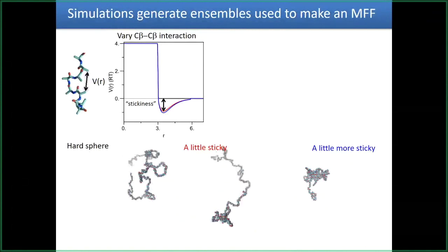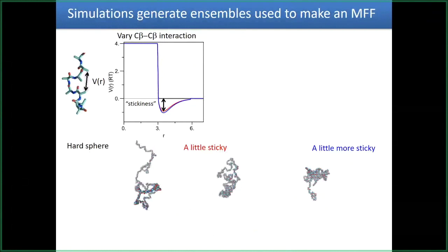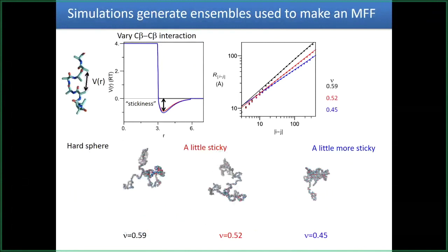The hard sphere one is sort of obvious. For the other ones, all we needed was some way to have a variable attraction so that it would produce an altered ensemble, which we could plot here. I don't think we actually used a Lennard-Jones. My guess is he probably used a series of splines, but it's not really going to make any difference here.